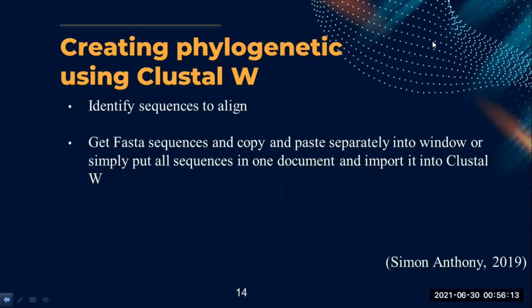My name is Von Losted, and I'll be taking you through the creation of a phylogenetic tree using the results of Clustal W. Firstly, a quick recap on what a phylogenetic tree is: basically a diagram which helps to show the phylogeny, or the evolutionary history of an organism, using different branches with the length being proportional to the amount of evolutionary diversity.